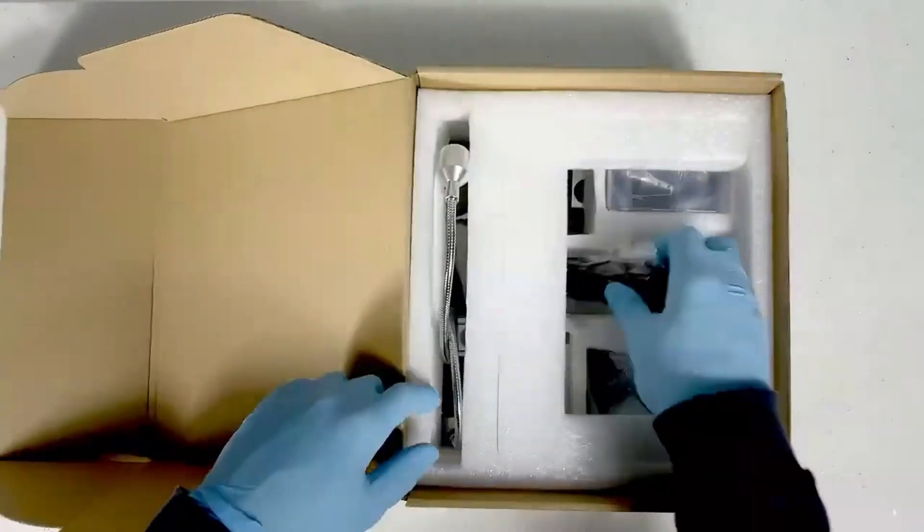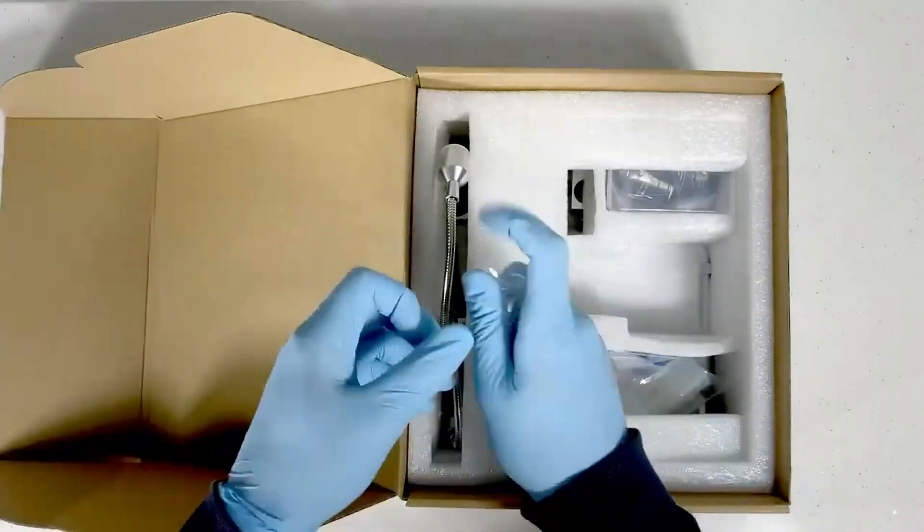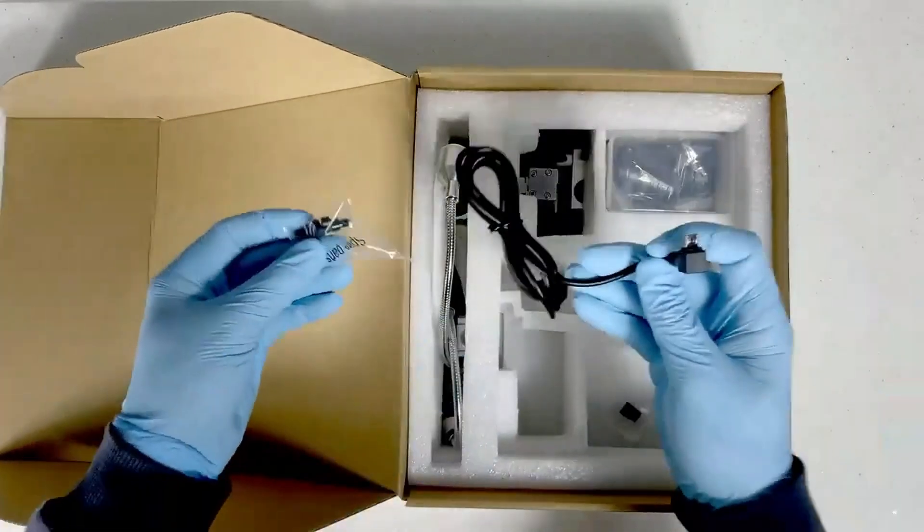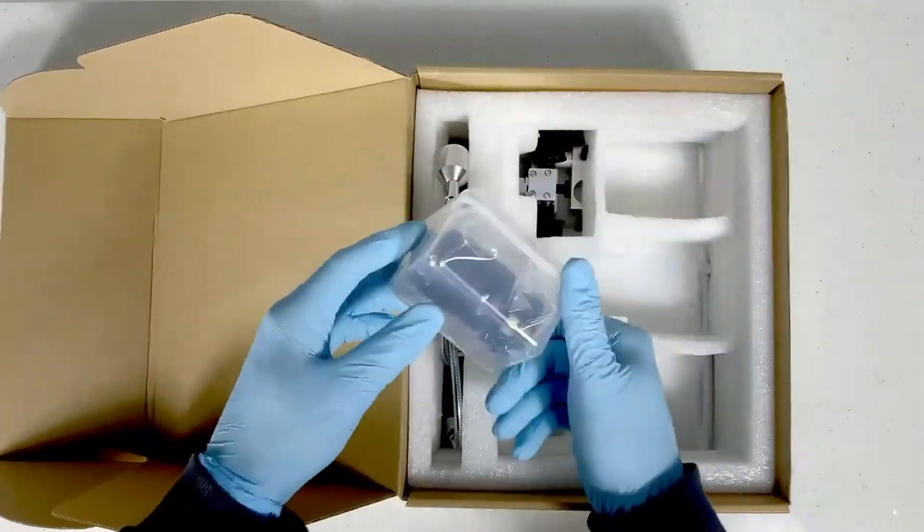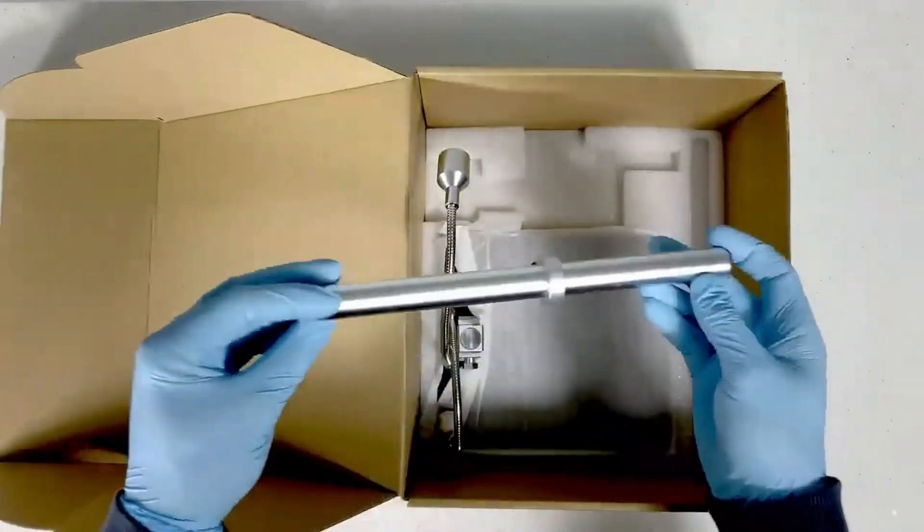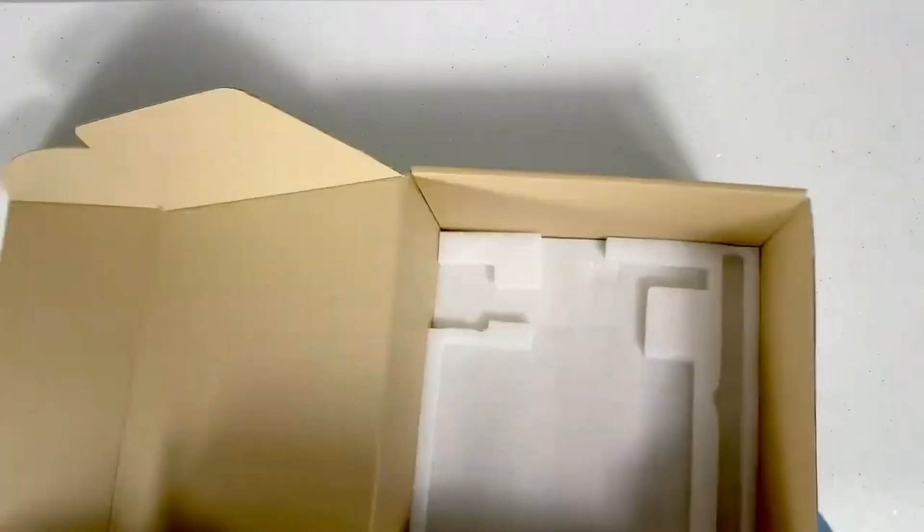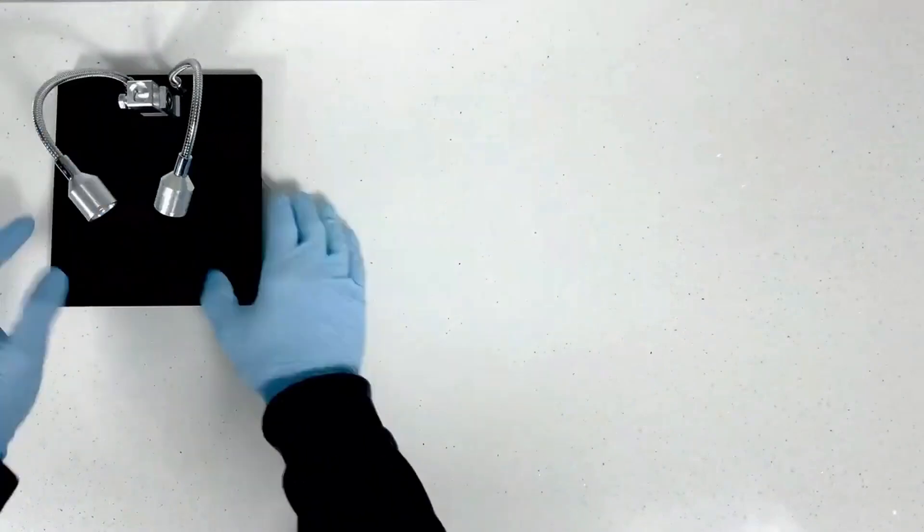Using the microscope is a breeze. You can easily swap out different lenses by removing and installing screws. Focusing is as simple as rotating the focusing wheel while adjusting the object distance is done with a knob on the bracket. Get ready for some serious magnification. The Andenstar microscope can reach up to 2,000 times magnification.